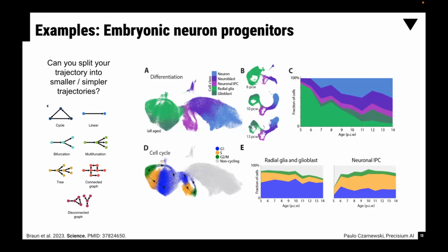But wouldn't it be the same for differential expression, that you would rather see the difference in data that has had batch effect removed? Exactly. But that comes when you do the differential expression, you run it on the clusters. The clusters were identified on harmonized space. The same thing goes for the trajectory. The trajectories or the cell ordering is also done on the harmonized data. But later on in my slides, I will show the differential expression on trajectories. Okay. Then you go back to the raw data. Okay. And then maybe that's where you're confused. The differential expression on trajectories is also on the raw data, and then it's exactly the same. I see. Okay, thanks. Perfect.